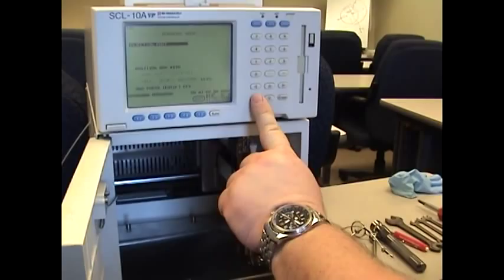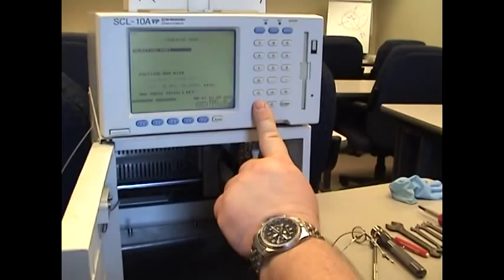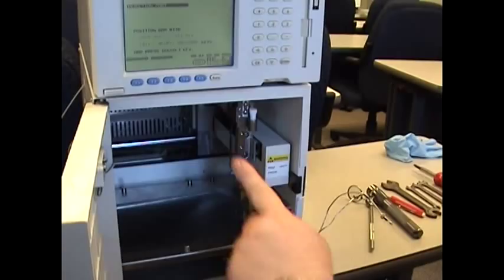You have to hit the F5 each time you want it to take a multiple step. It will take a number of times for that to move all the way down to the proper position.